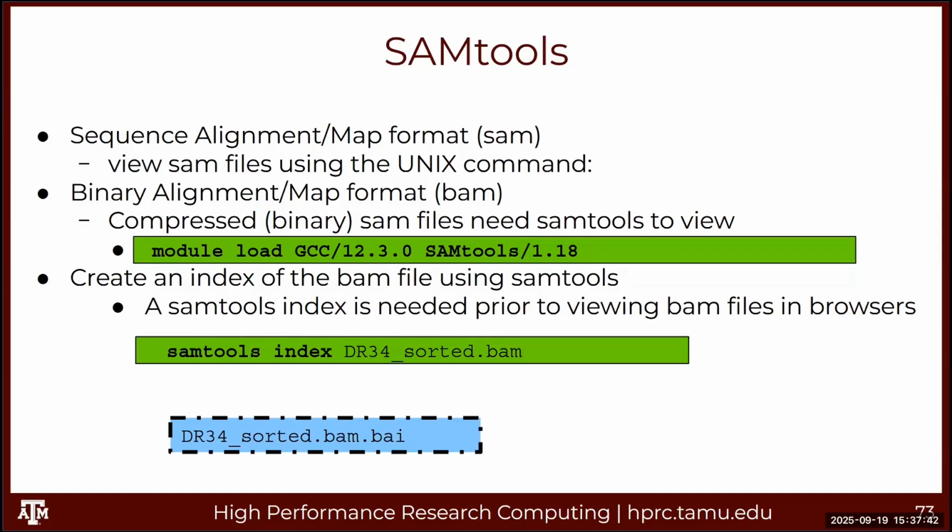SAMTools index. SAMTools will create an index of the BAM file. It helps some software to sort through the BAM file quicker. So go ahead and type these two separate commands in.